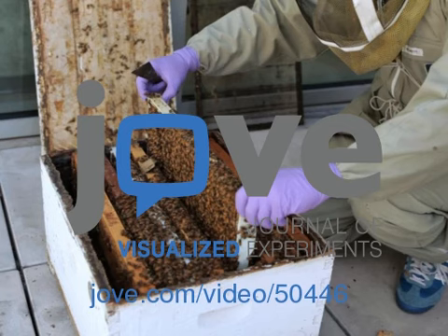To prepare the bees for injection, chill newly emerged bees in a 4°C refrigerator for 1 to 2 minutes. Once the bees are immobilized, mount 3 to 4 bees in parallel on petri dishes full of solid wax, with insect pins crossed between their abdomens and thoraces. Chill the bees again in a 4°C refrigerator for about 1 to 2 minutes. Ensure the bees are completely immobile.